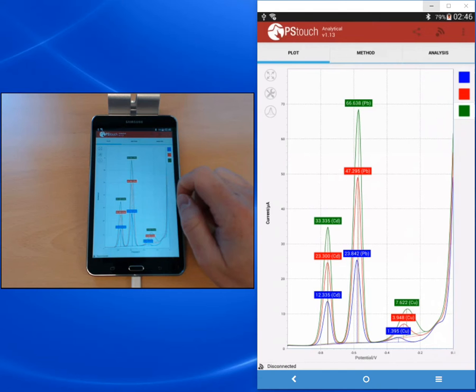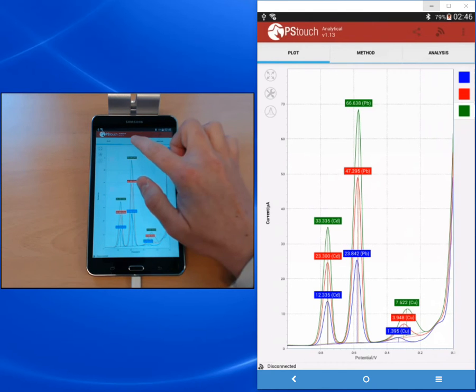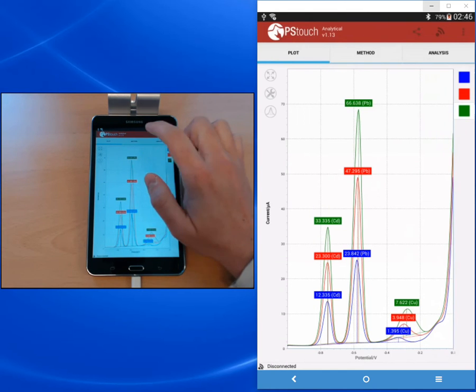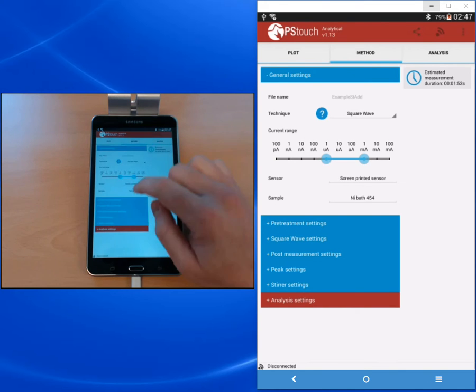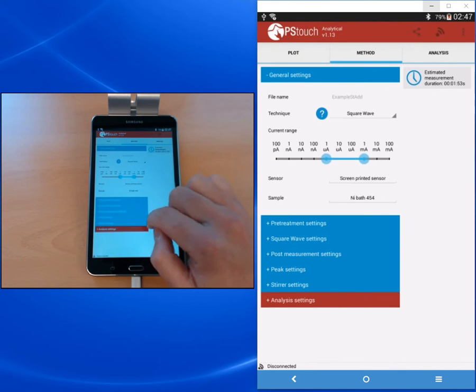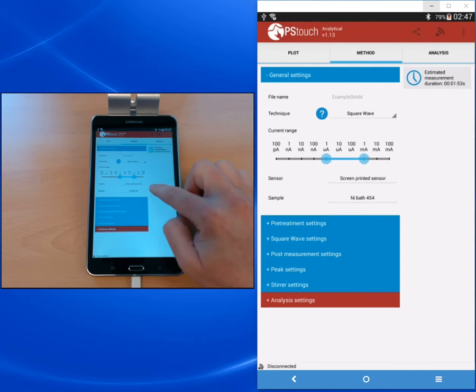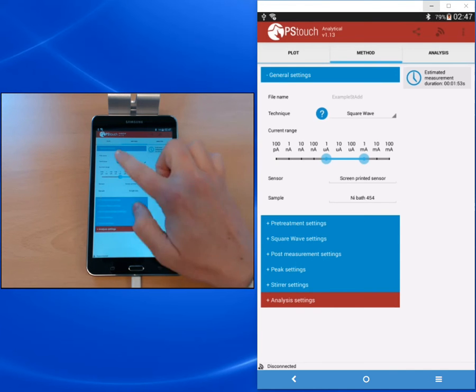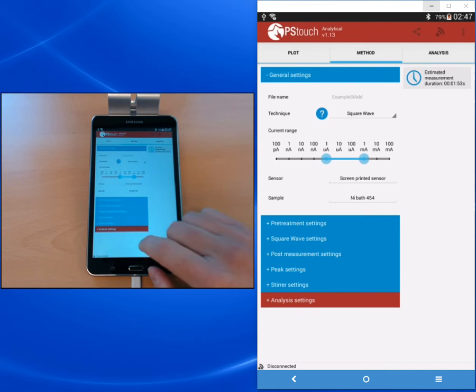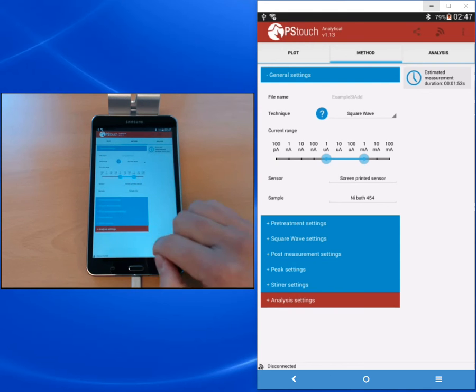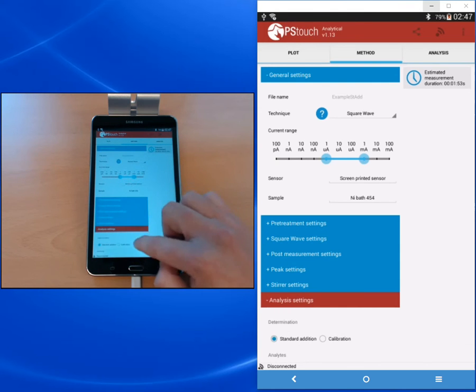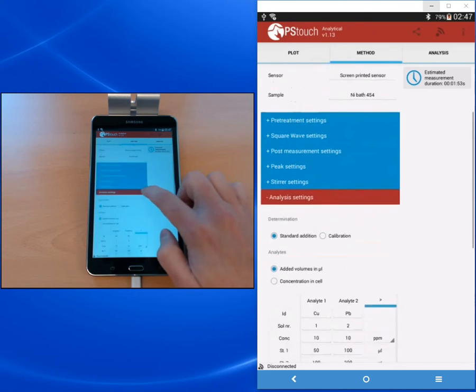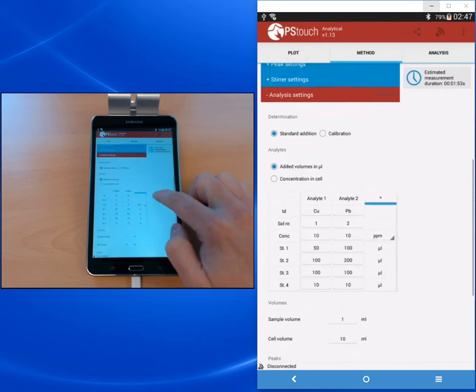After we've assigned all the curves, we need to set in the method parameters the information about our standard solutions. If we go to the method editor, you see the blue parts are already known from the normal mode. The red part is specific for the analytical mode. When you open it you get the analysis settings.